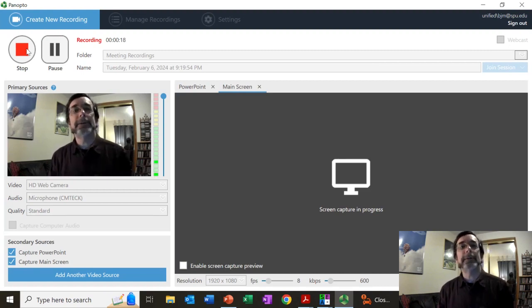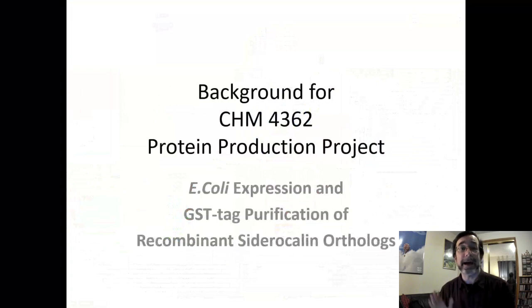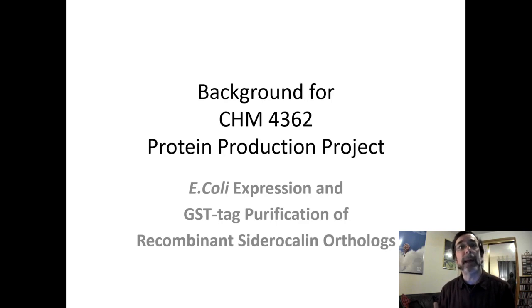I promised you I would tell you why we're doing it, and I promised you that I would make it worth your while, because this is not just an ordinary lab experiment. This is an actual experiment. This is more like an apprenticeship than a paint by numbers kind of protocol. The protocols that we're following were developed from my postdoctoral work over at the Fred Hutch, so this is how we made proteins over there, and now I'm bringing them over here to make proteins.